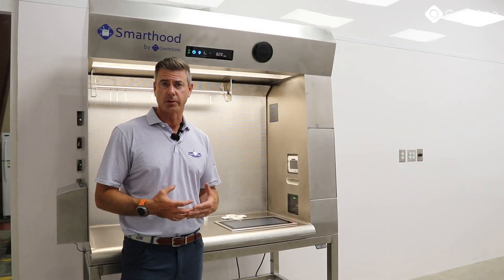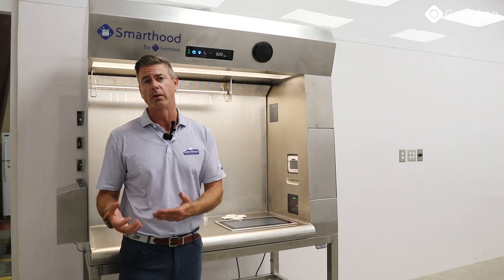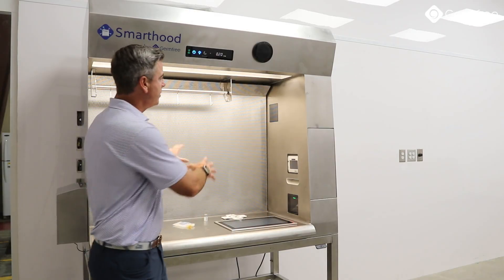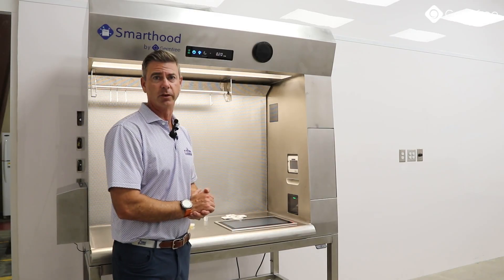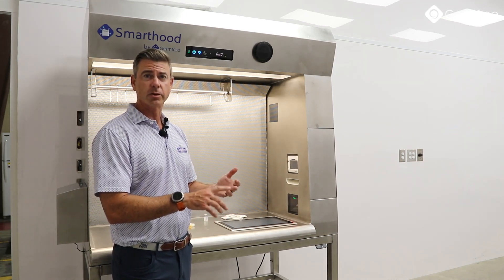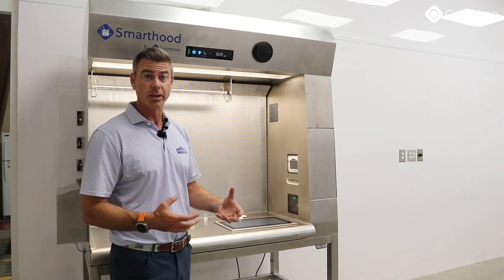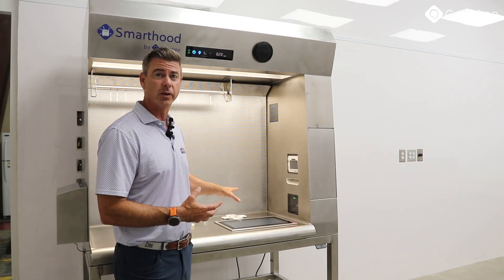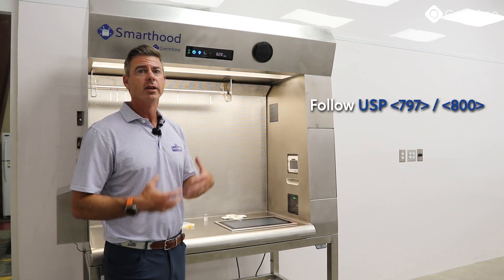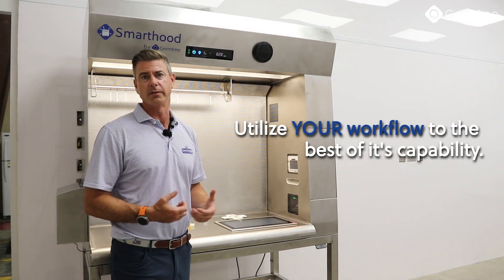So what you've seen here are the capabilities of SmartHood. This hood has everything that you need to run your gravimetric or non-gravimetric workflow built into the hood. Everything I did, I'm able to keep my hands inside the sterile field — allowing me to validate my components, take photos, gravimetrically weigh, as well as communicate with everyone inside or outside the organization from inside the sterile field. This really helps with the ability to follow USP 797 and 800, to promote better aseptic technique, and really utilize your workflow to the best of its capability.